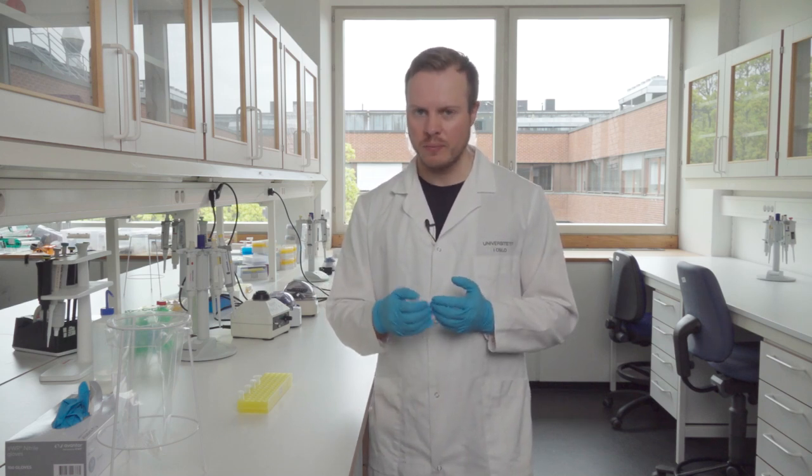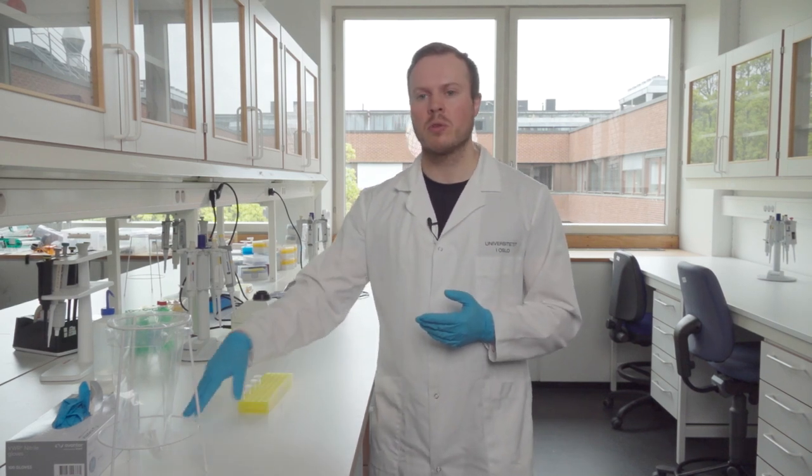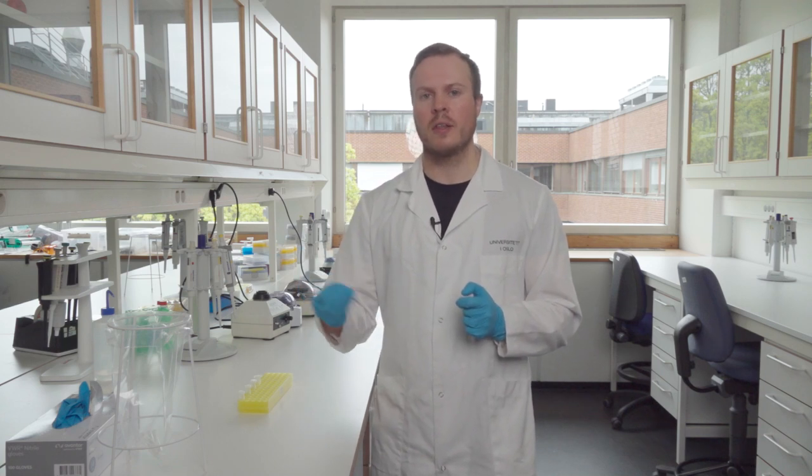It has a lot of similarities, but this is where we add the index primers. The index primers help us distinguish the different samples from each other because they are unique barcodes that are added to the adapter part of the primers we used in the previous step.